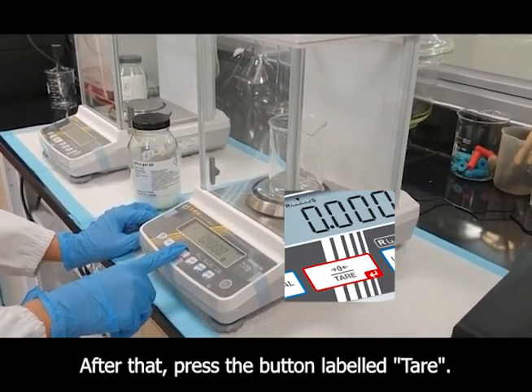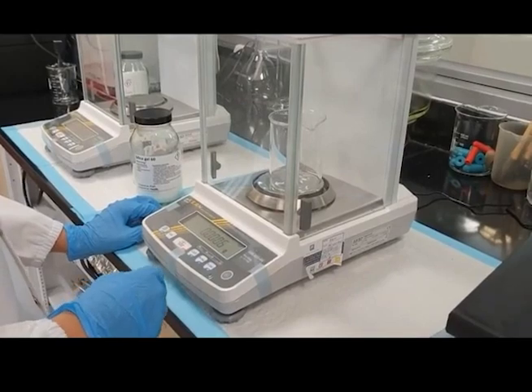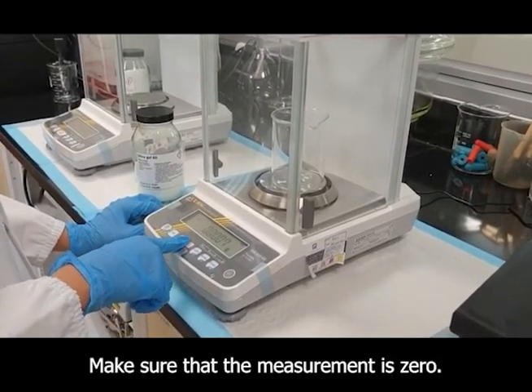After that, press the button labeled Tare. Make sure that the measurement is zero.